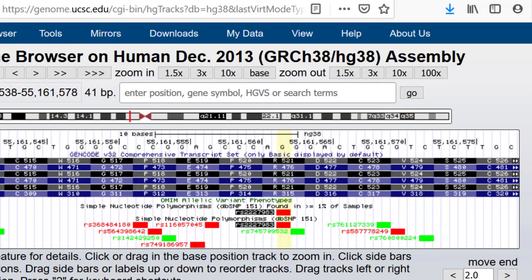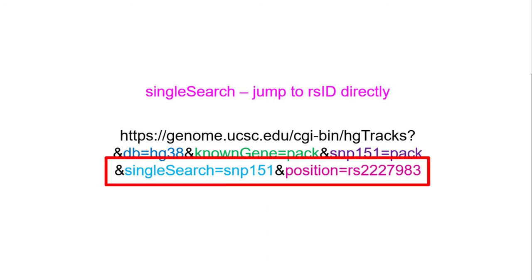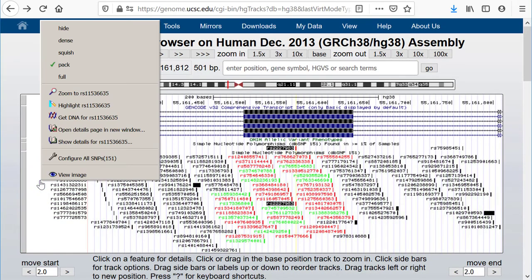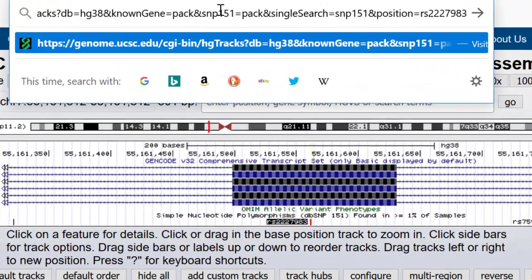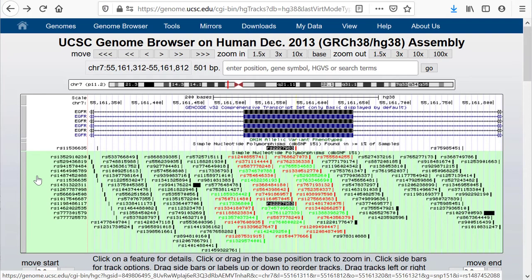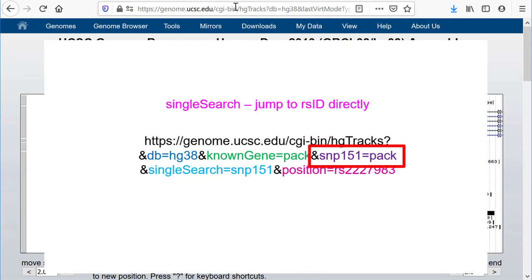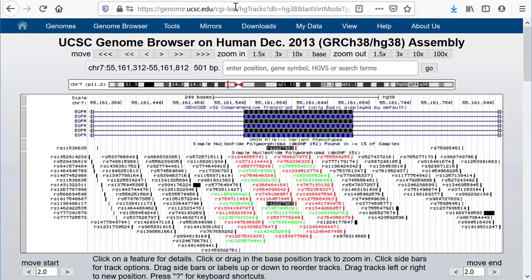You can get around the disambiguation page if you use singleSearch, which we saw earlier in the context of searching for genes. Specify the search table as SNP151 and the position using an RSID — so we have ampersand singleSearch equals SNP151 and position equals RSID. Let's turn off the SNP151 track and use the URL to confirm that it will turn back on. We see that it does. If you use hideTracks=1 in your URL, then you must also turn on the SNP151 track explicitly if you are using singleSearch. Otherwise, you will go to the correct location, but the track will be hidden.